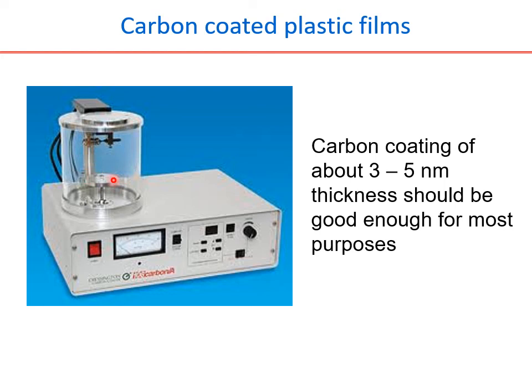Again, we will revisit this concept of water at a later stage, because if you recollect, with great pain we dehydrated the specimen in the earlier stage, and now we are talking about the presence of water here. That will be addressed when you go for the staining process.